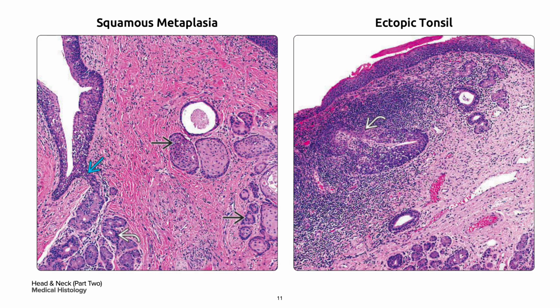On your left are the serous von Ebner glands, in the curved white arrow, that are draining into the furrow, in the single blue arrow, separating the circumvallate papilla from its adjacent furrow. This is thought to flush out the furrow contents in order to allow new tastes to be better discriminated.